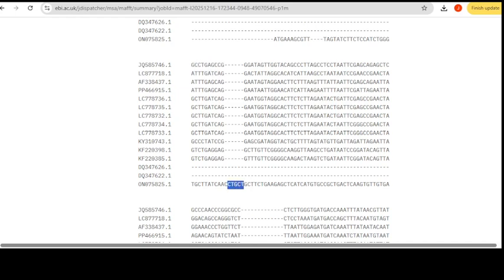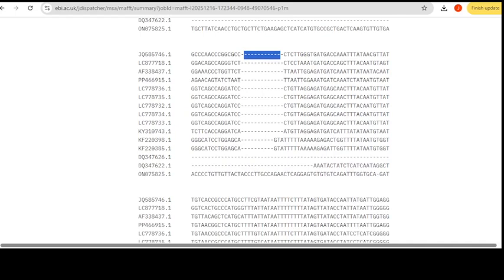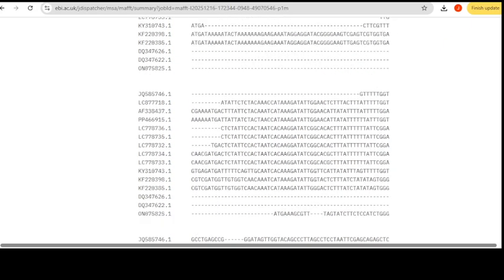So this portion is deleted right there, and it has created these dashes here to show that this portion doesn't have any match in this particular sequence. Not even a closer match, not even with deviation. So this one is kind of an insertion here, and the rest are matching on top of each other. But again, there are further deletions compared to the other sequences, like this one here. So now we have the alignment.